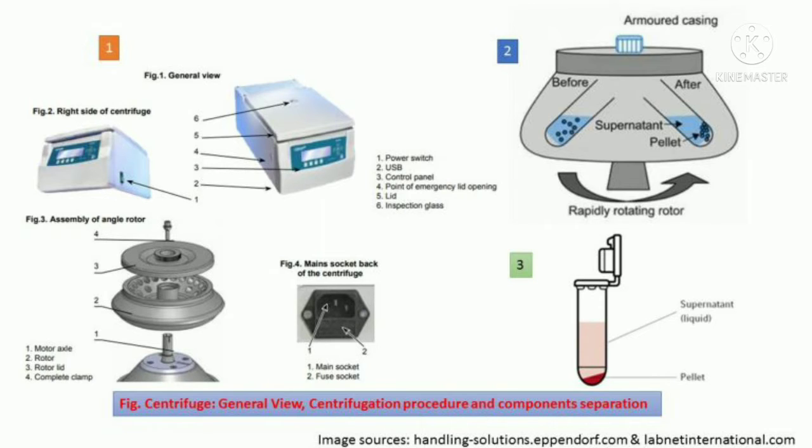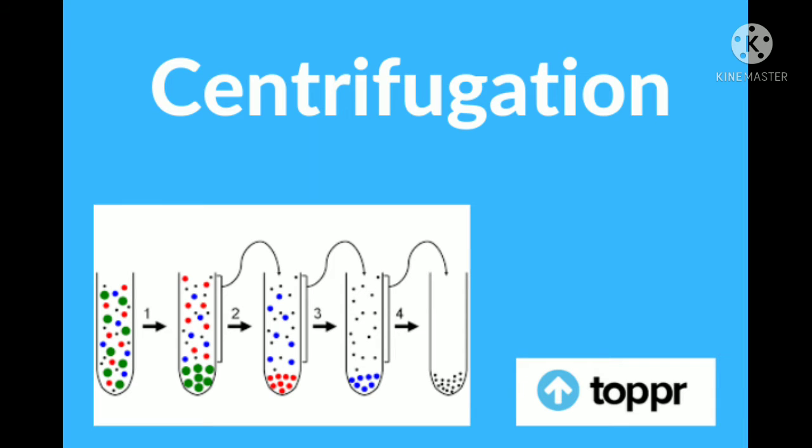Another question I want to share with you is: what is the main principle on which centrifugation works, and why is it mostly used in blood banks? A centrifuge works on the principle of sedimentation under the influence of gravitational force, which it uses to separate according to density. The different types of separation include isopycnic, ultrafiltration, density gradient, phase separation, and pelleting. So these are the main functions.